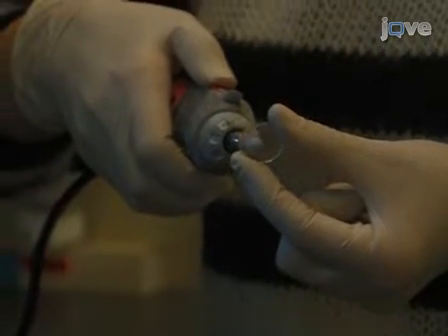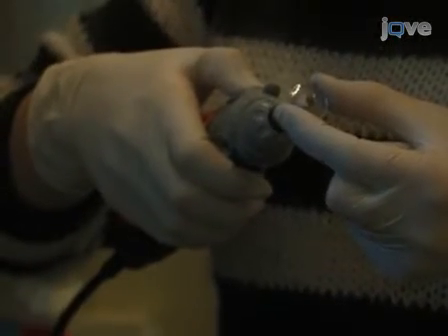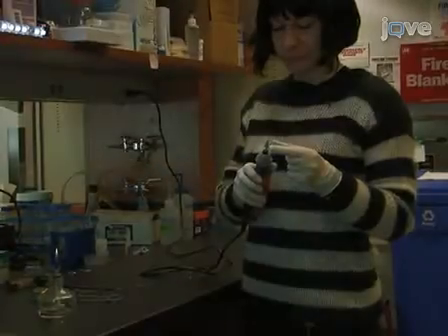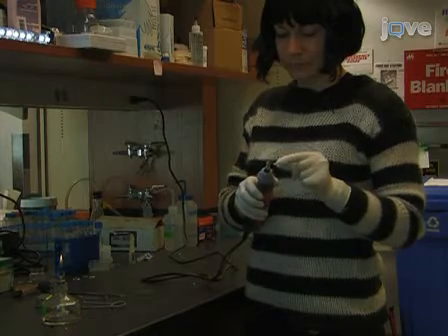Now use a small, cone-shaped Dremel bit to make a 6 to 7 mm diameter hole in the centre of the dome-shaped plastic base. Make the edges of the plastic base completely smooth by sanding it with the Dremel and further filing it.